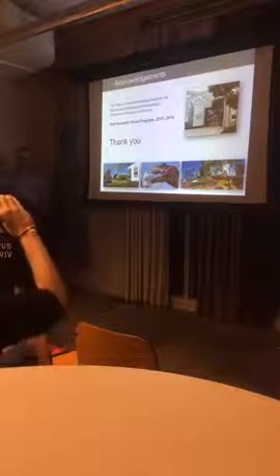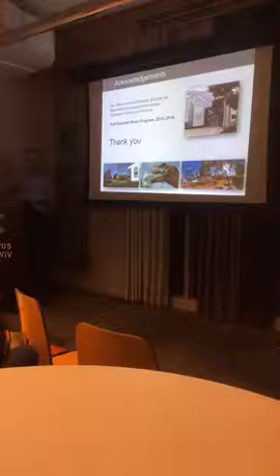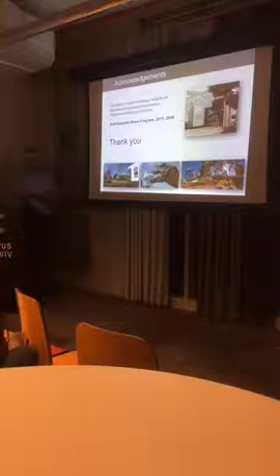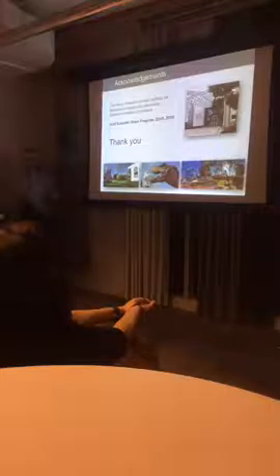But I did mention that laser speckle imaging could be used on humans for free. You can take any camera and laser, and you can use it on a human and, for example, acquire the pulse, any changes in the blood flow. There are a few companies that already commercially sell such products based on laser speckle, but it's very cheap to build yourself.